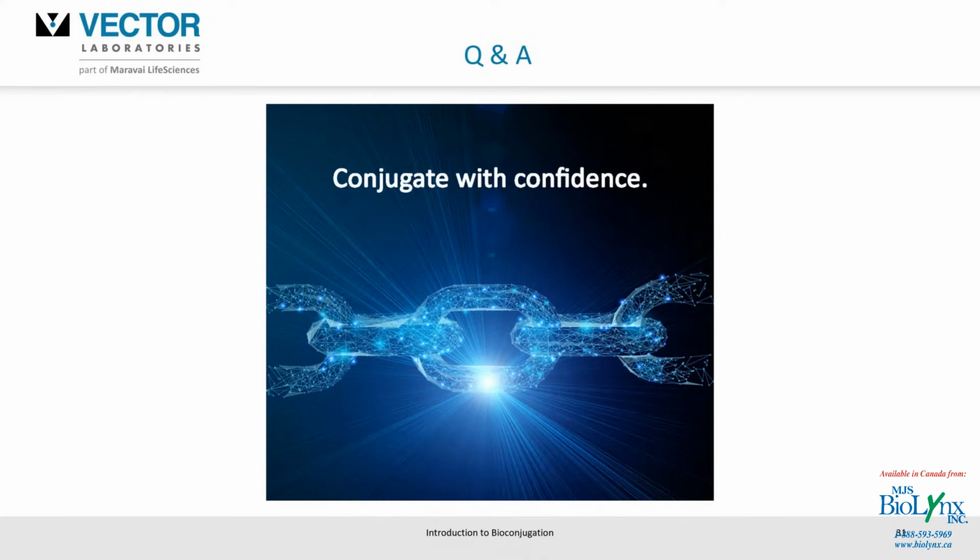Great, thank you. The next question is, what is the difference between the protein oligo conjugation kit and the antibody oligo kit? Yeah, I didn't really expand on that in the presentation. As you saw, for the oligonucleotide kits, we've got an antibody and a protein oligonucleotide kit, and also for the biotinylation kits, we've got an antibody and a protein biotinylation kit. That does pose the question, okay, if I'm not using an antibody, can I use another protein for the other kit?